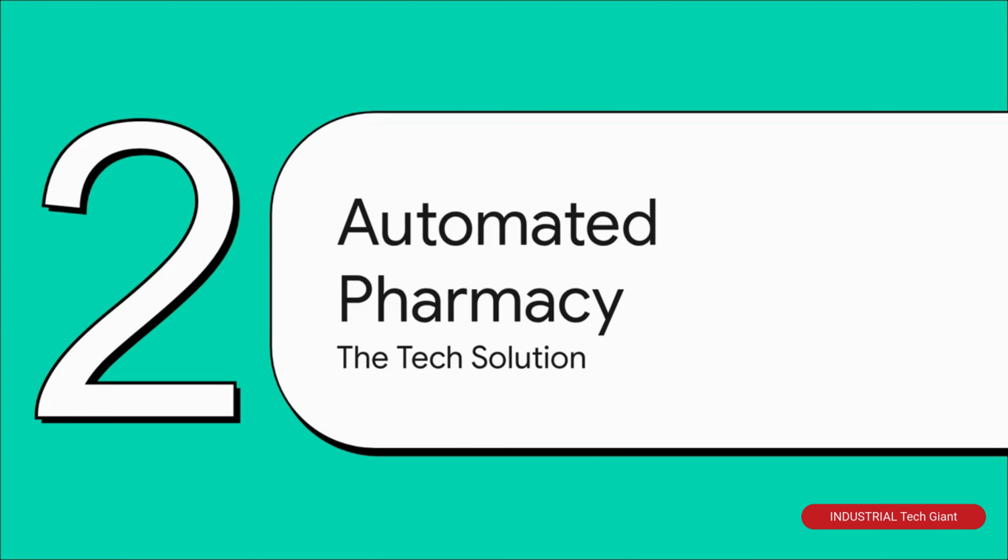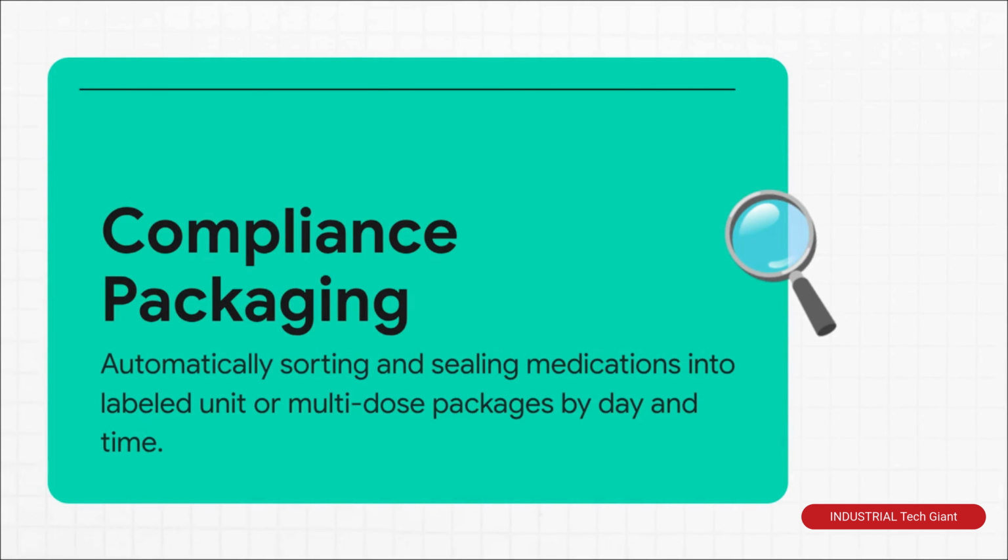Okay, so we've laid out the problem pretty clearly. Now let's talk about the solution. This is where technology really steps up to the plate and transforms the entire process. And the core idea here is something called compliance packaging. It sounds technical, but it's pretty simple.